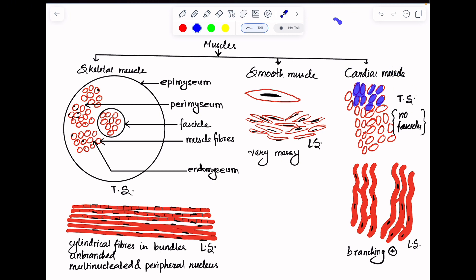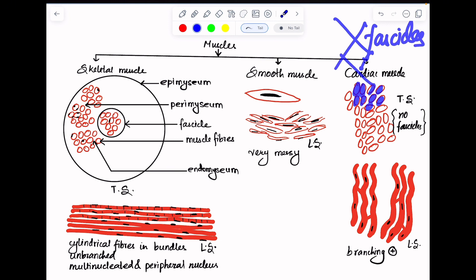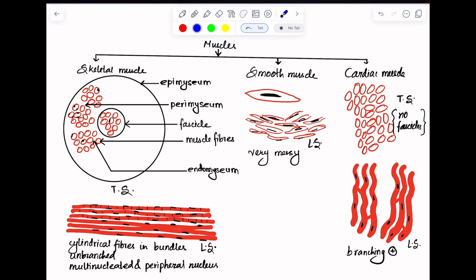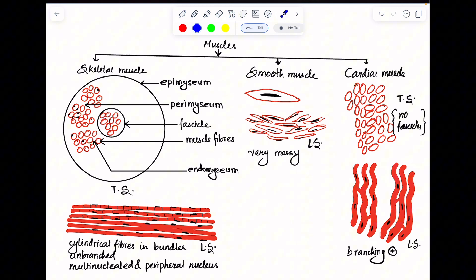In cardiac muscle transverse section, you will also be able to see cardiac muscle fibers; however, these cardiac muscle fibers are not arranged in fascicles, and there is no gap like perimysium in between them. In skeletal muscle you had fibers arranged in bundles with perimysium between them, but in cardiac muscle there is no such bundular arrangement with perimysium.